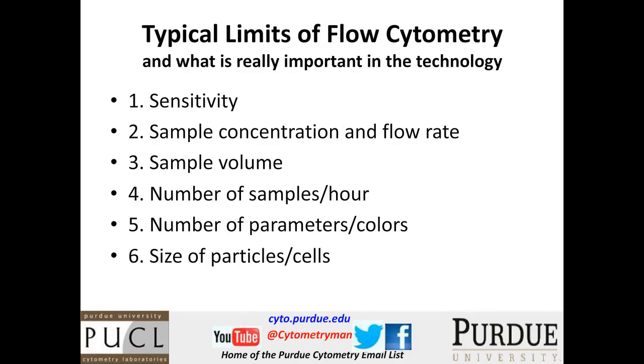Sample volume. What happens if you just simply don't have very much volume? What do you do? And that's an interesting question because when we talk about flow cytometry, I can guarantee you that we always say, look, flow cytometry is fantastic because you can look at such small volumes. And this is true, except that if you only have a few microliters of sample, then it's not so easy to actually run it on most flow cytometers. And then the other issue is the number of samples per hour that you might have.